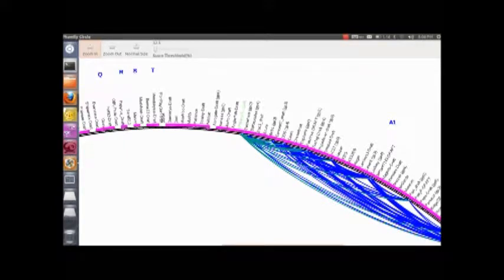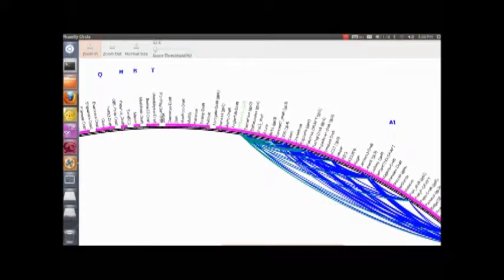And see how when you click on it, it now lights up and shows you which one it's related to. Before I clicked it, they were all the exact same colors.